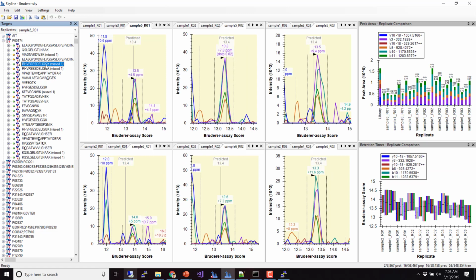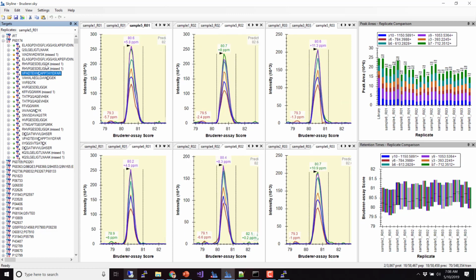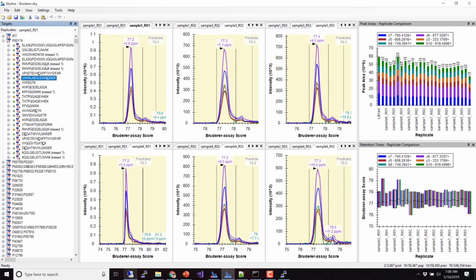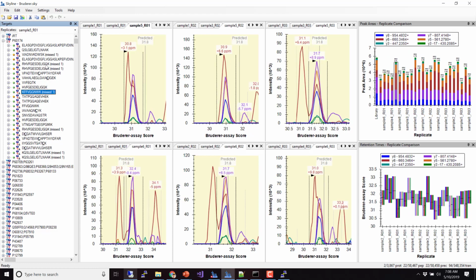But you can see that things get chosen pretty consistently. And I think we're going to find places where we see interference. Yeah, like here. This is our worst fear about interference. Here we're not getting so much interference, we're getting a little bit from this thing. This other thing is caused by, what is this caused by?